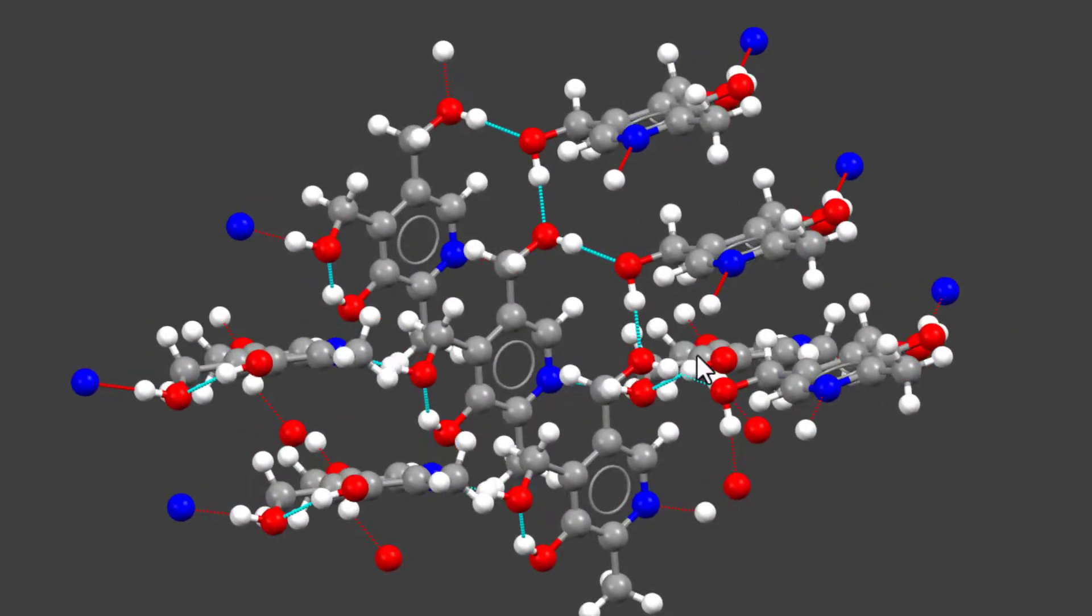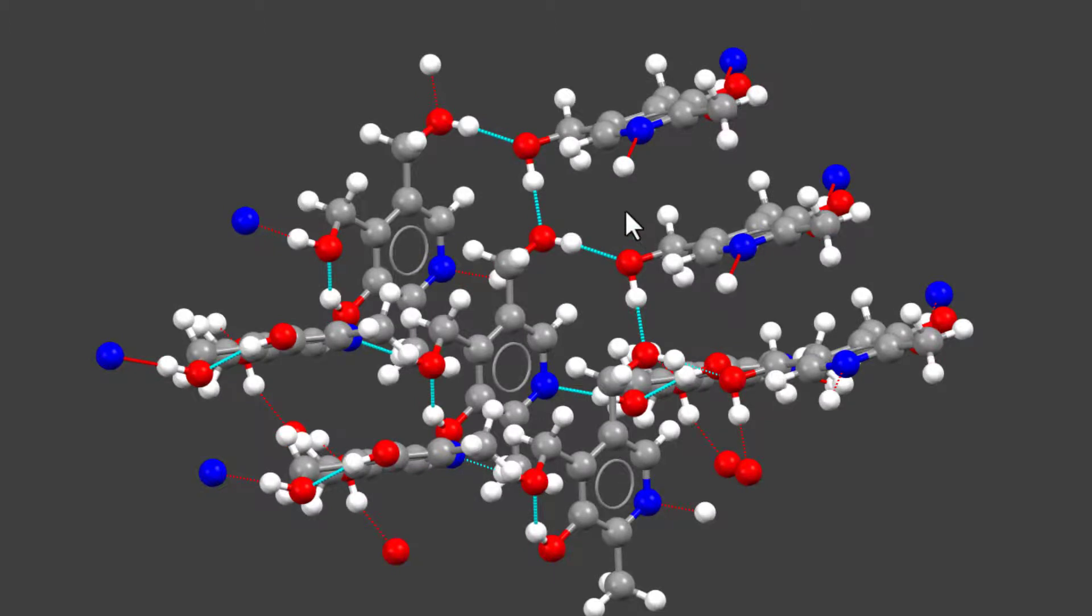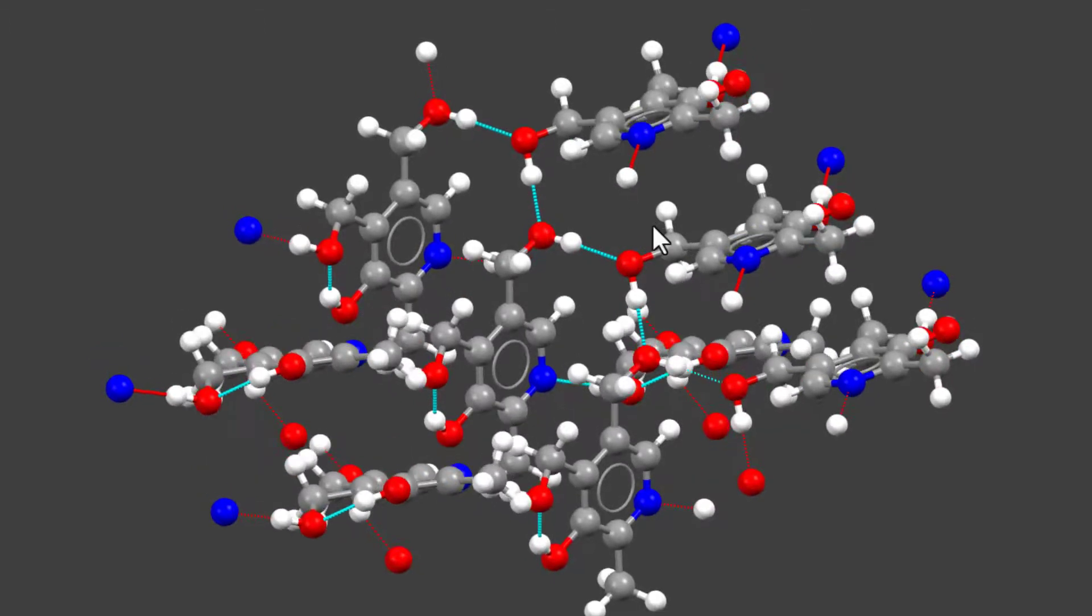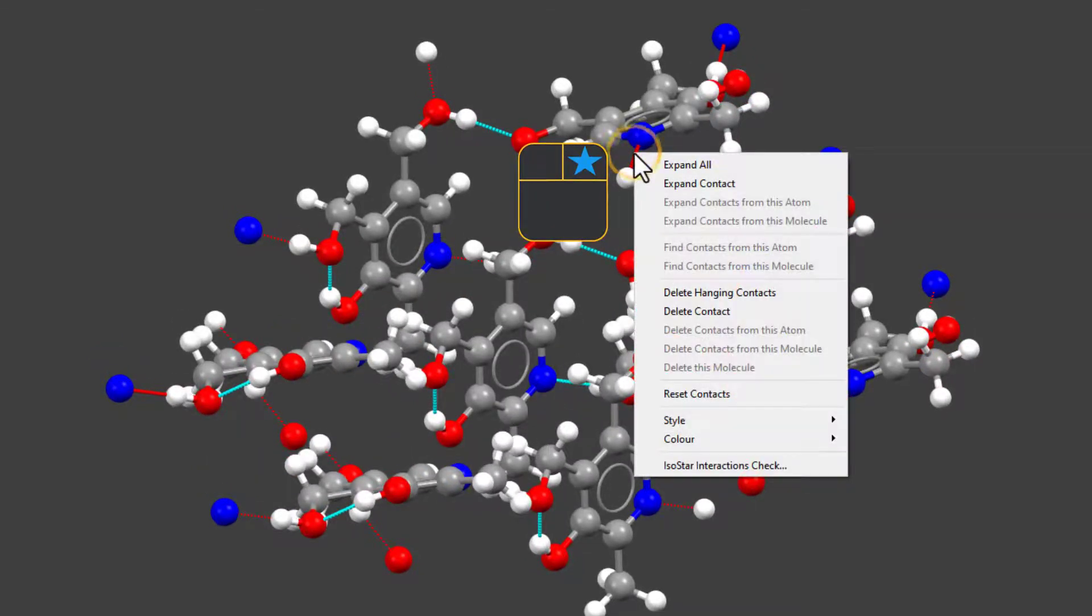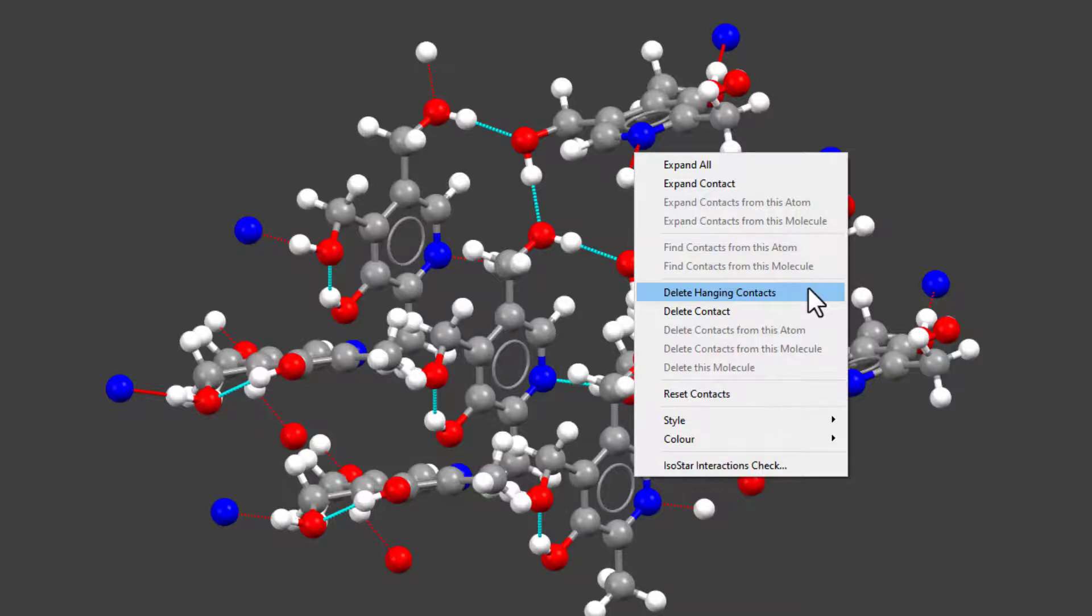At this point, we might want to remove the contacts that are left hanging. To do so, we right-click on a contact and we can see a number of options coming up. For this, we'll choose delete hanging contacts.